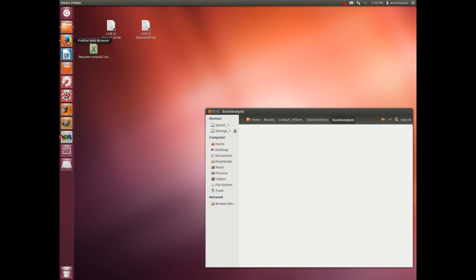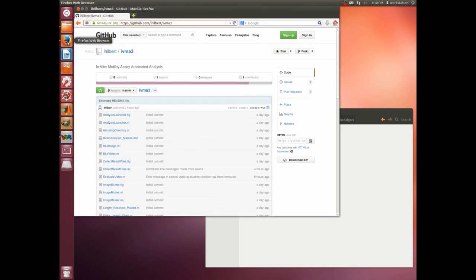If you have already installed the software, then probably you don't have to look at and listen to the first parts of this video. You can see here the address of the repository where you can go and get all the source files that will be necessary to run the software.